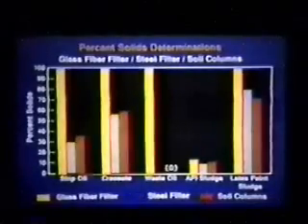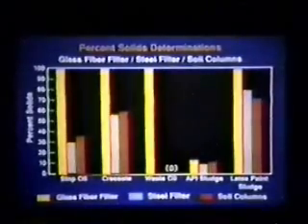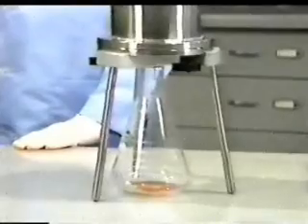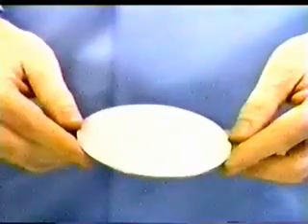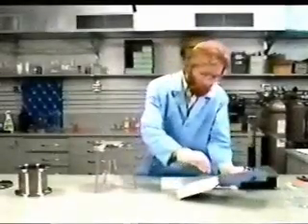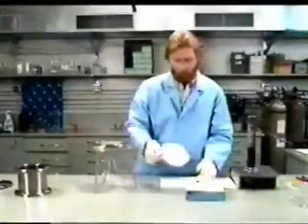Third, we developed a new procedure by modifying the filtration step of the old procedure that we feel is adequate and accurate, and we demonstrated its accuracy and precision by evaluating it again, comparing it with the column results. Because the current method 1311 is adequate for filterable wastes, and because the stainless steel filters are relatively expensive, the modified method retains the glass fiber filter for wastes that filter satisfactorily through it. The steel filter is only to be used if clogging of the glass fiber filter is encountered.